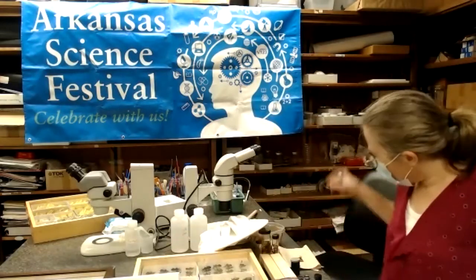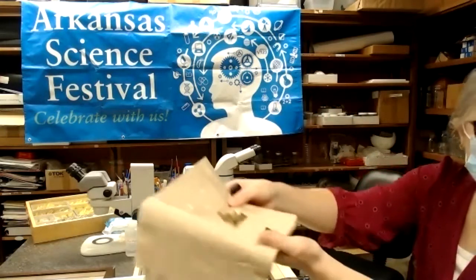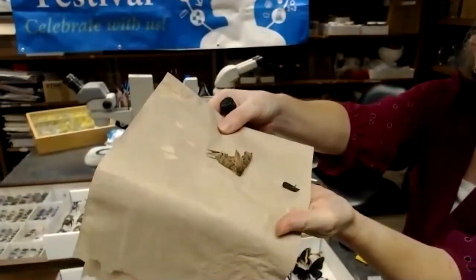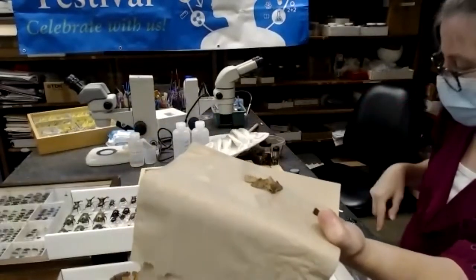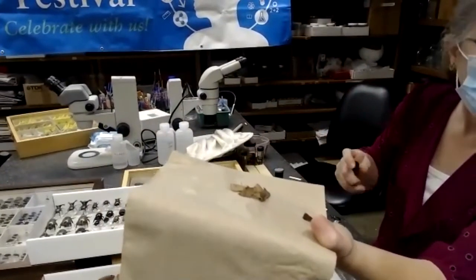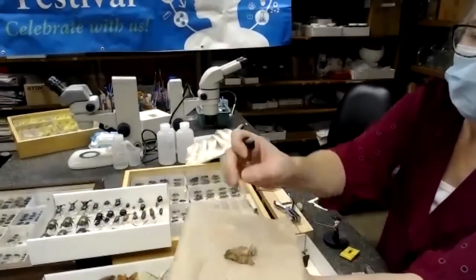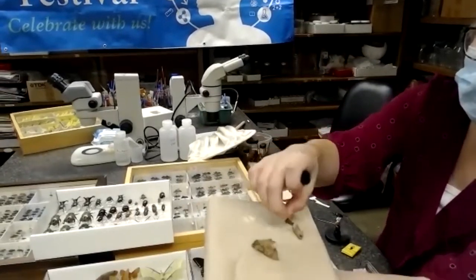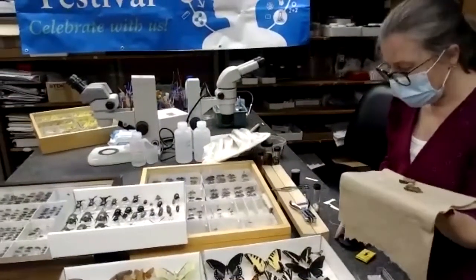And when we do that, here, for example, is a moth that you can see that has been collected. Actually, this was collected from a student. And I'll show you here in a minute how we can actually go about pinning this beautiful, actually it is a hawk moth. Oh, we have some other moths which we won't pin, but let's look at how we would do that.